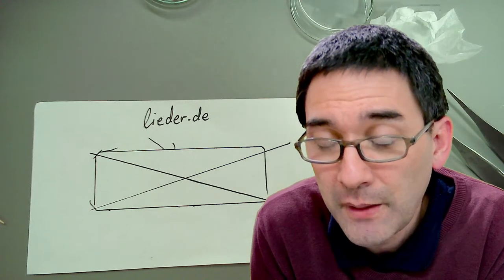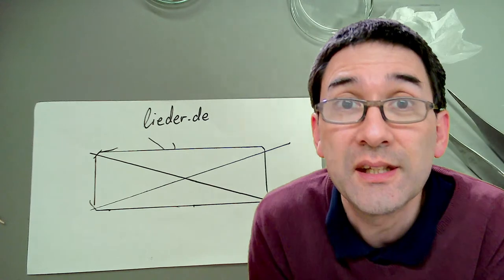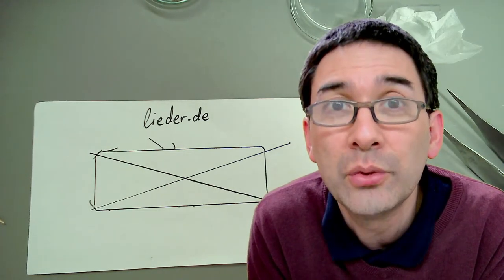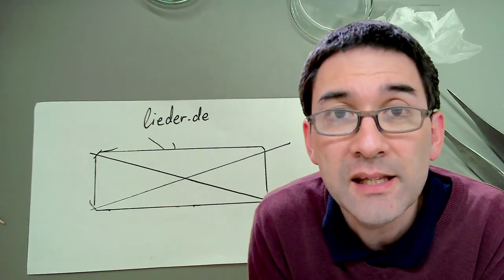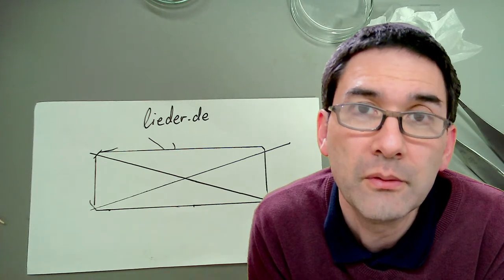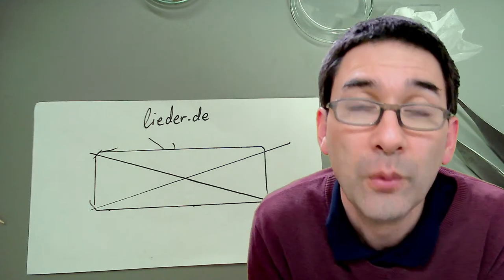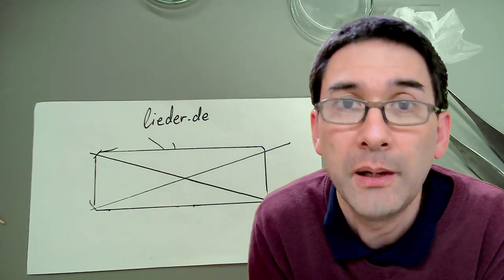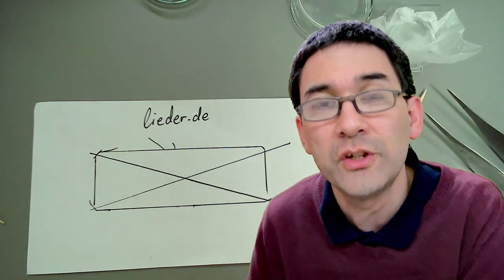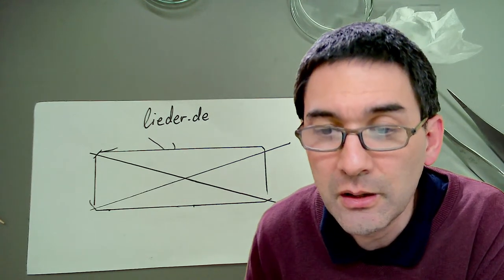For pollen grains, the only thing I can recommend, because this is the standard medium, is glycerin gelatin according to Kisser, K-I-S-S-E-R. That recipe for glycerin gelatin is apparently the standard for people who are studying pollen. So it's not the normal glycerin gelatin, but the one according to Kisser.